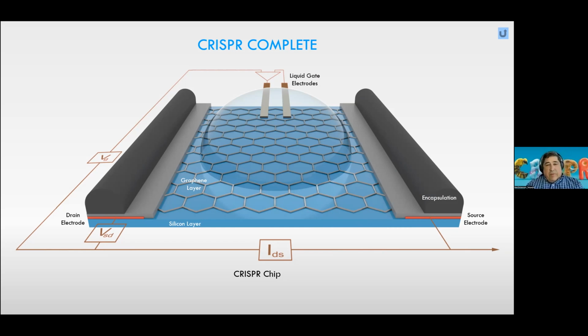And this is the only chip I ever create. Every day I come to work, this is the chip I'm creating, not going beyond this. So, let me back it up. I'm only on one transistor out of that array of 3 channels and those 5 times 3, 15 redundant ones. But you do see here the graphene design that Francie explained very nicely. So these are what the chips come to us in the lab. What we do is we take the pyrene.